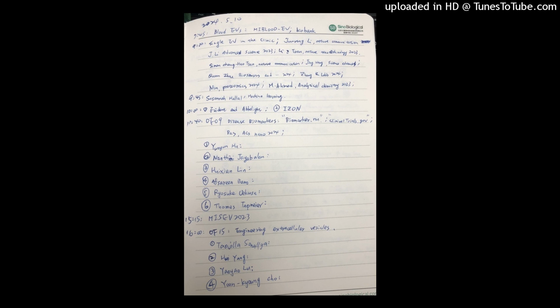Sorry, I was just going to say something before you started. I'm Clotilde Théry. We have lots of biomarker studies that people want to do in our institute or with partners because I have created the EV platform at Curie. The problem I have is that we cannot force people to measure the platelets, to measure the lipoproteins. They don't know how to do it. They don't want to put the effort into that. So my feeling was that it would be easier for us if we have the EV platform to measure remnants of platelets, markers, or lipoproteins in the EV preparations.